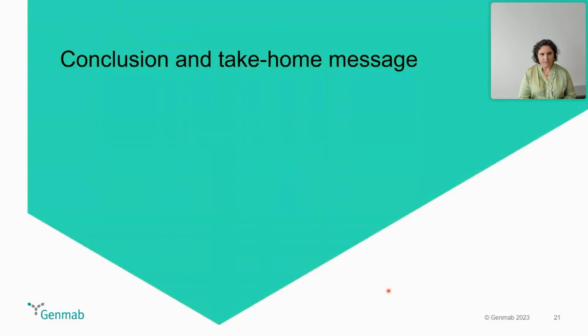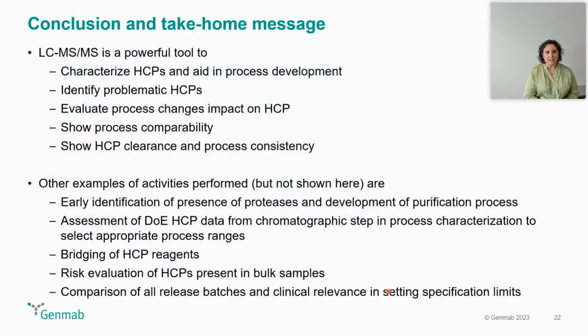So, conclusions and take-home message. LC-MS is a powerful tool to characterize the HCPs and aid in process development, to identify problematic HCPs, evaluate the process changes' impact on the HCP and comparability, and then also to show HCP clearance and process consistency.